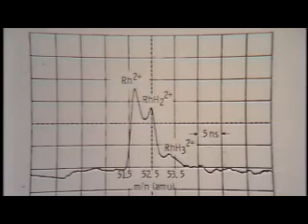We have very good mass resolution. Remember now, we have to be fairly close, because the image diverges radially into space, right? So if we're too far away, we need a big detector. So experimental constraints say be about 10 or 11 centimeters away and use about a 3-inch detector.